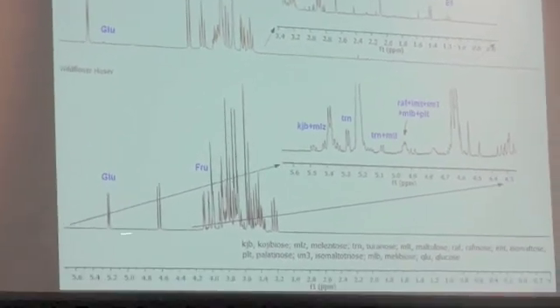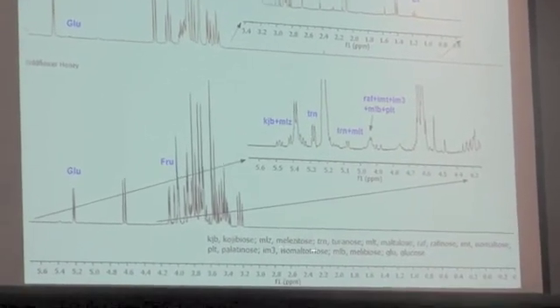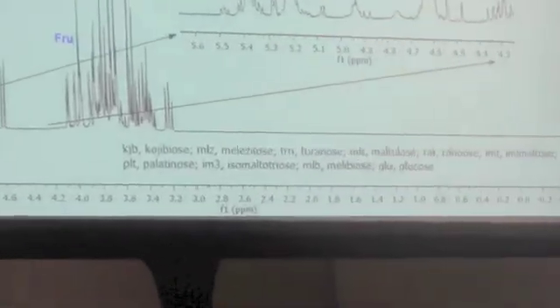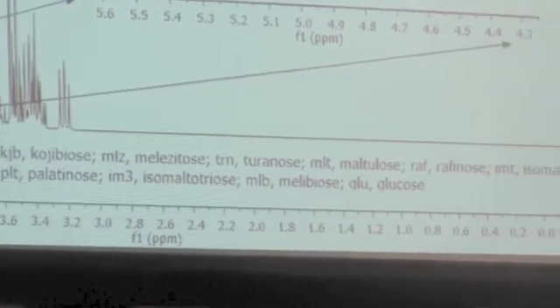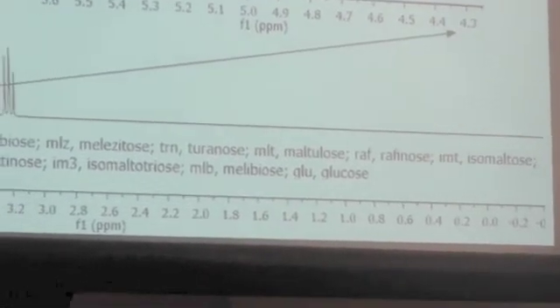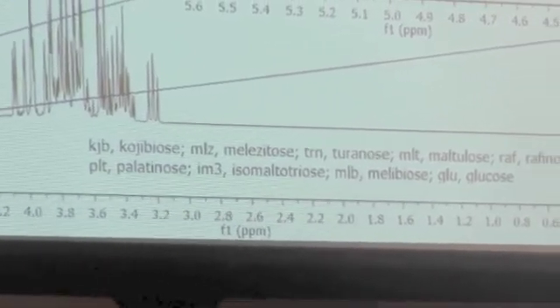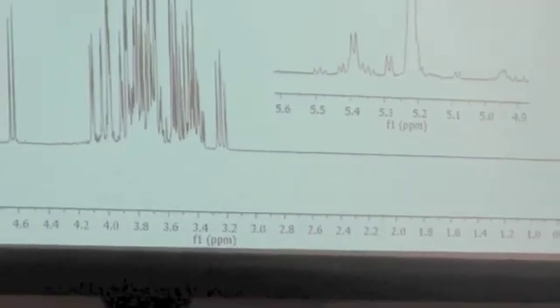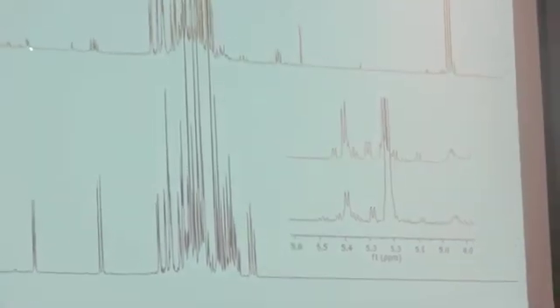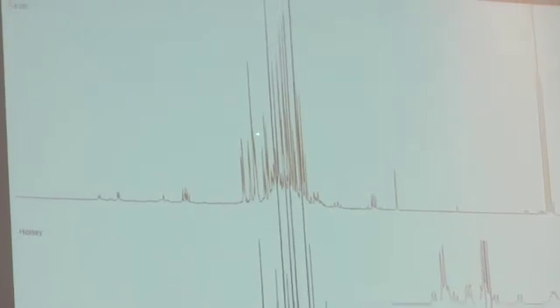When you zoom into this area here, you'll see there's all these little peaks in here, and these are all these weird sugars and disaccharides that the yeast can't process. So they stay there. That's probably a lot of the residual sweetness if you had a really dry mead or a really dry cider or something like that. So this is a cider right here, and you can see that the finished cider has this complex chemistry in here. All the glucose is gone. There's a lot of fructose. It always seems to get left behind.